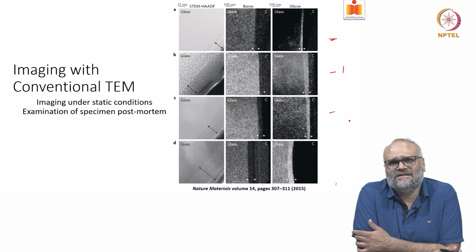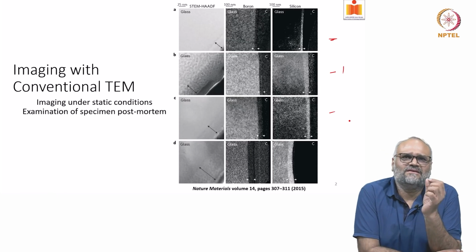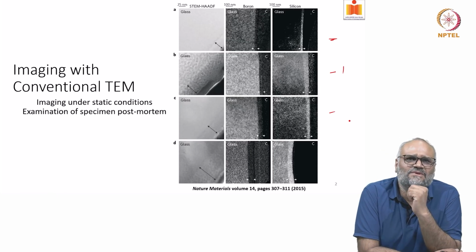What we did here was, there was some problem of what kind of chemical composition change is happening within a glass.